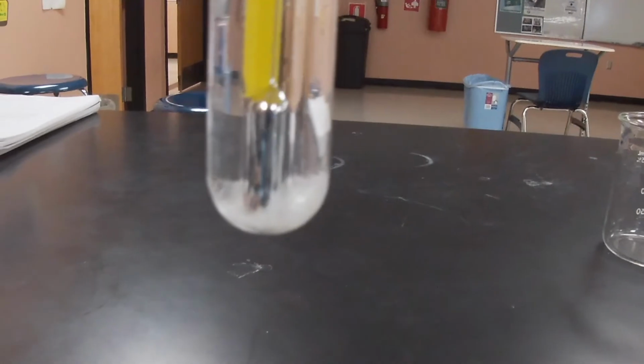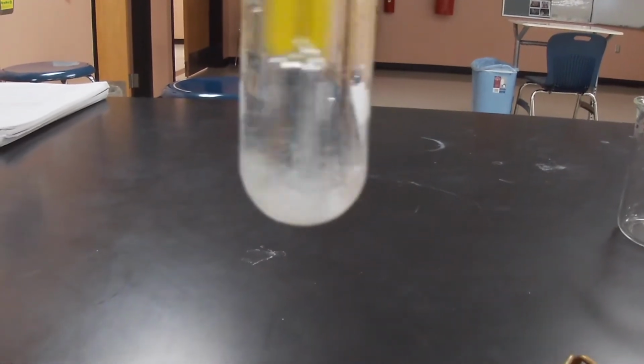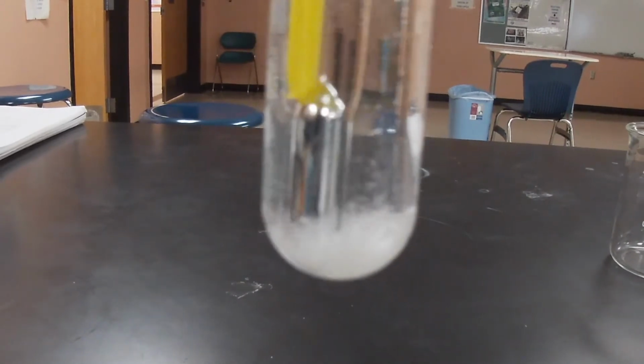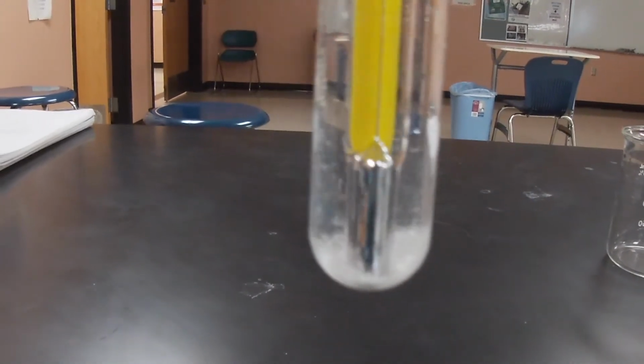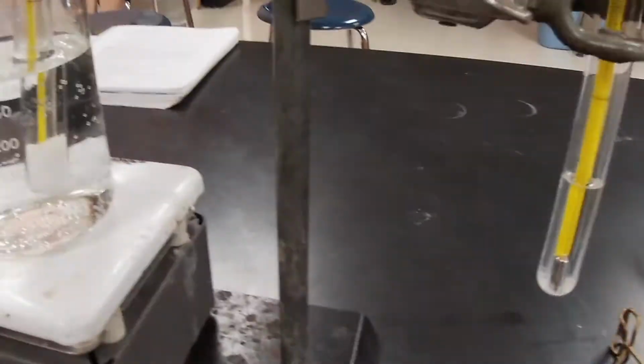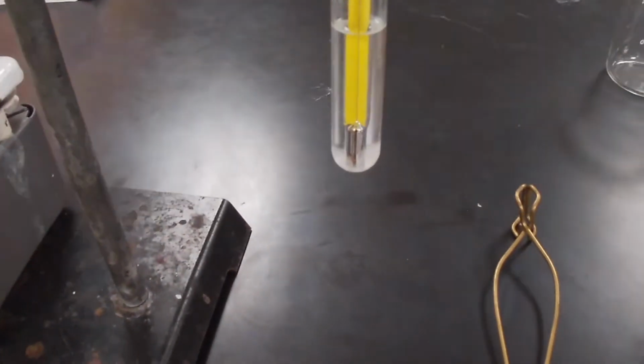And so I'll zoom in one more time. I'll stir it slowly so that you can see that crystallization. And like I said, we recorded our temperature. It happened nicely. And so now, let's go ahead and move on to our 4 gram one.